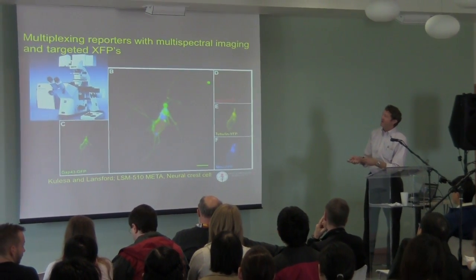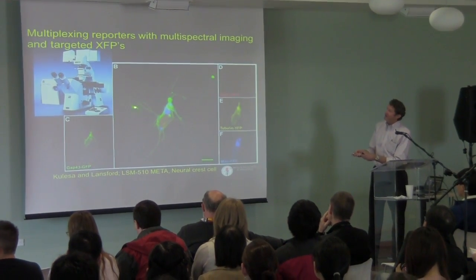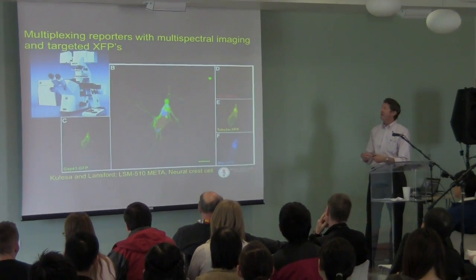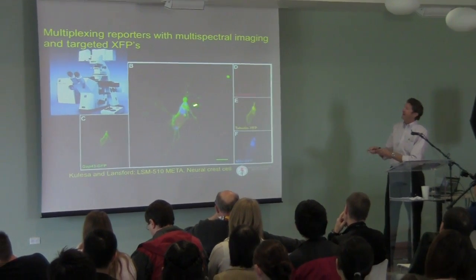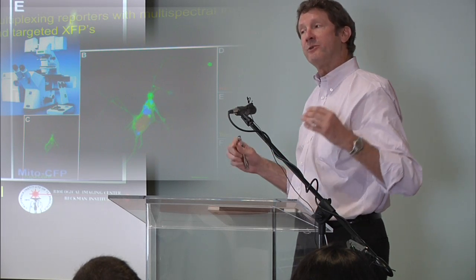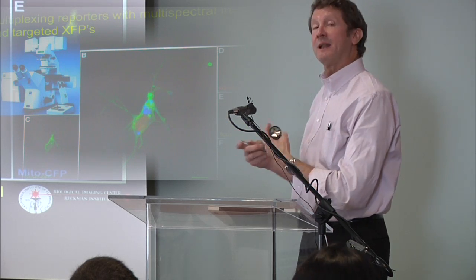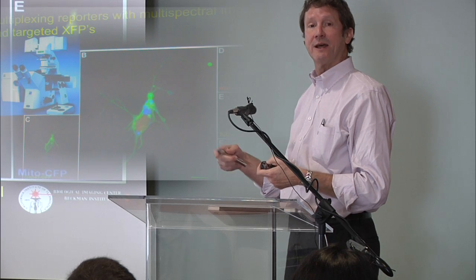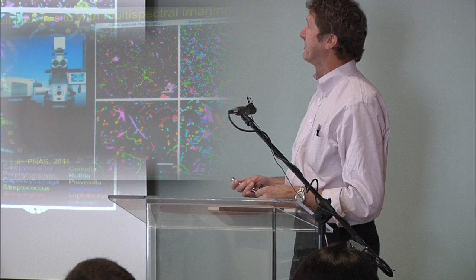And so Rusty Lansford and a fellow from JPL, Greg Behrman, and I, a few years ago developed something that became the new generation of Zeiss microscopes, multispectral laser scanning microscopes, that allow us to label and follow cells and actually see, I hope you can see, all the little protrusions reaching out of the cell, so we understand the range of contacts of the cells, and also be able to label structures within them and exploit that ability to label structures to target a number of fluorescent proteins to do multiplex reporter genes and things of that sort.